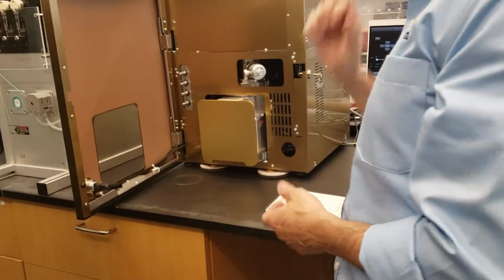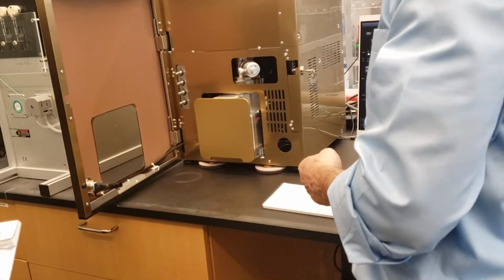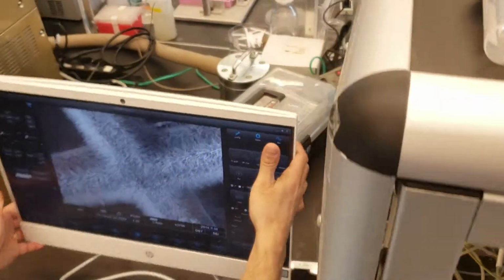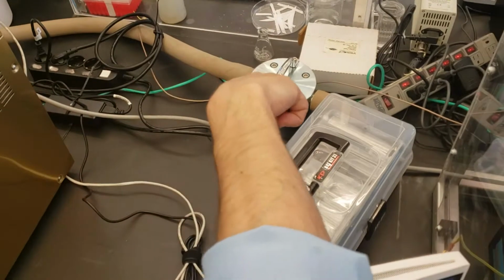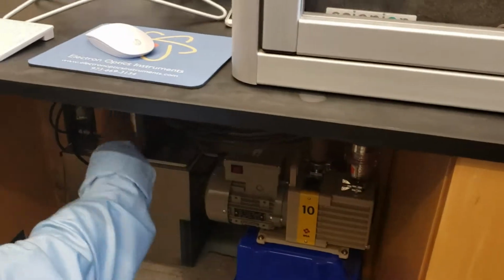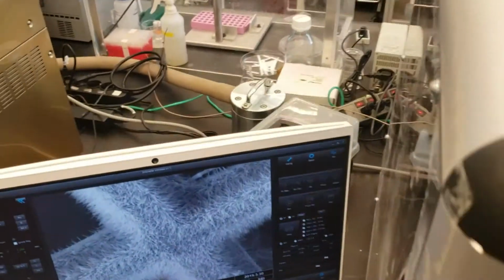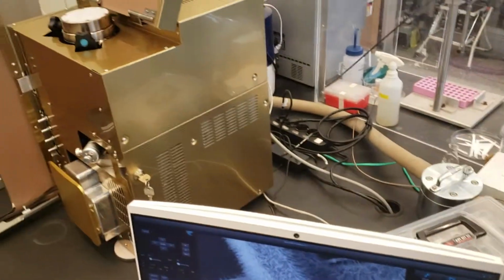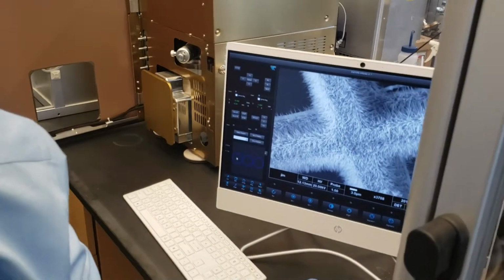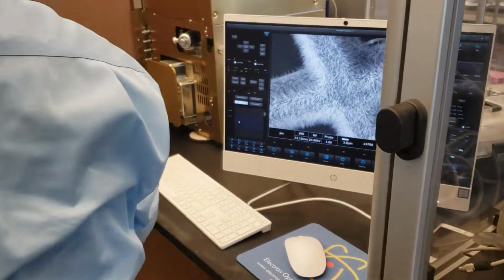This is a turbo pump vacuum system, so it's got a turbo pump internal to the back of the housing, and then there's a hose that runs from the back of the SEM to a vibration damper right over there behind us, right? Yep. This metal damper right here. And then that runs down all the way to the bottom to this roughing pump. Right? So initially you have a mechanical pump, it's pumping out through the damper, and it's going all the way to the back of the SEM, and it's pumping down the manifold section of the SEM, and then eventually when it reaches a certain vacuum level that it likes, it exposes the turbo pump to it, and then it pulls down to a maximum vacuum level.